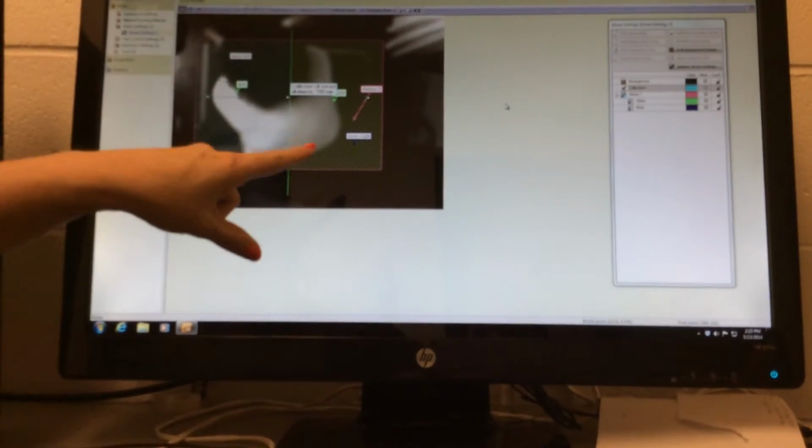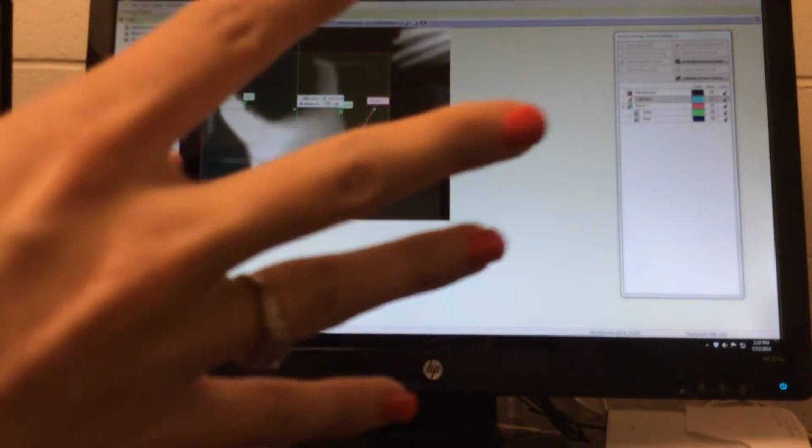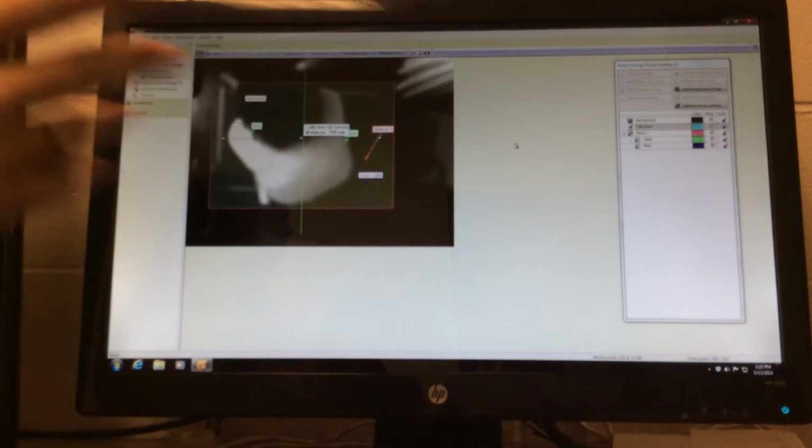Okay. If you're doing something basic like a rectangle or a circle, nothing oddly shaped, 1 measurement is enough. Support will say that with any arena, 1 measurement's enough.